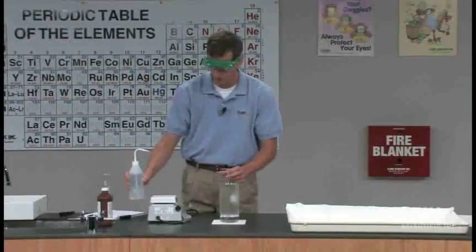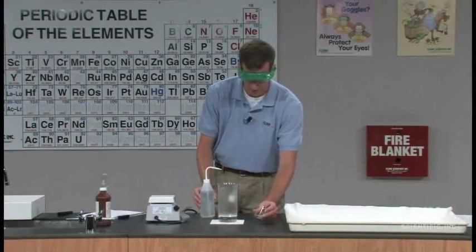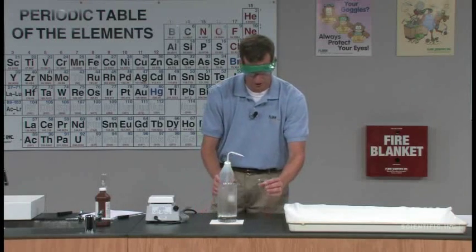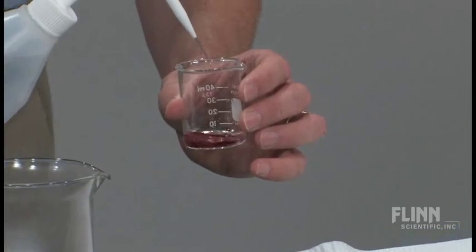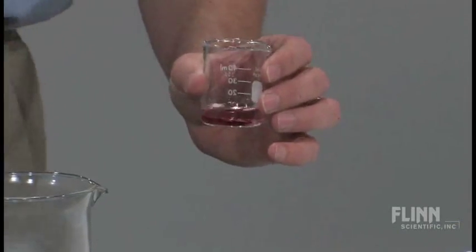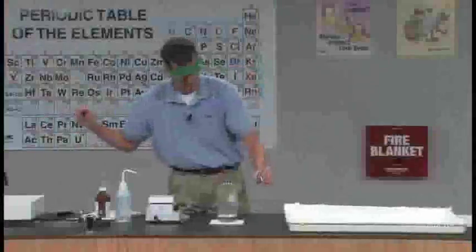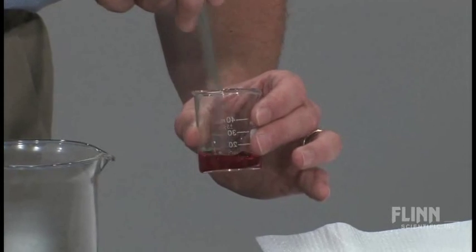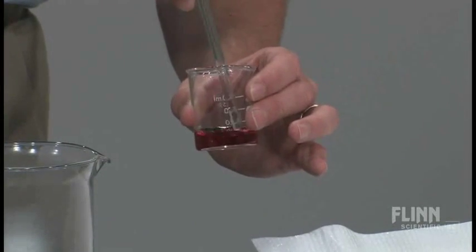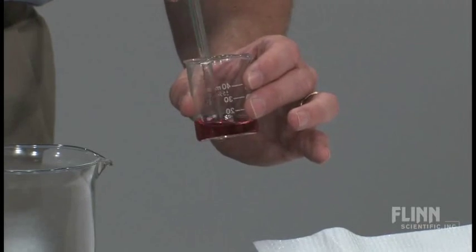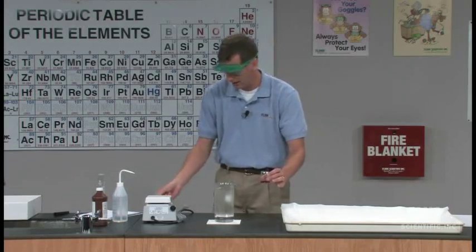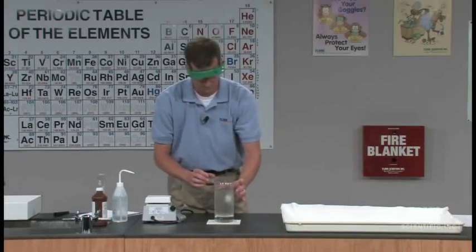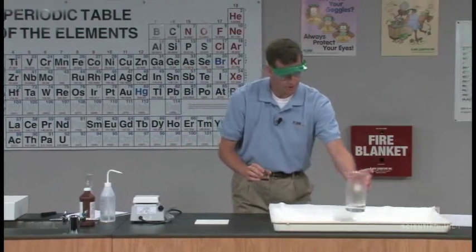While we watch that CO2 form there, I'm going to make my catalyst, and the catalyst that I'm going to make is a little bit of cobalt-2 chloride. I've got 0.4 grams weight out in there, and to that I'm going to add just about 10 milliliters of distilled water. And you can notice the pink color of our catalyst. And what's going to happen is our catalyst is going to give another pathway, another mechanism for this reaction to take place, and it will speed up the reaction.